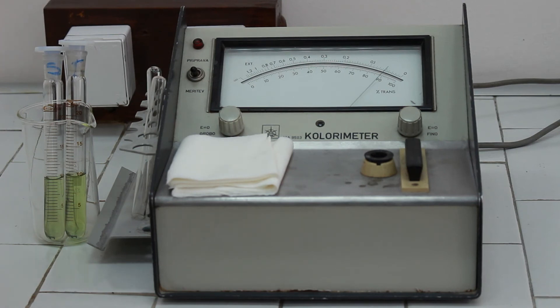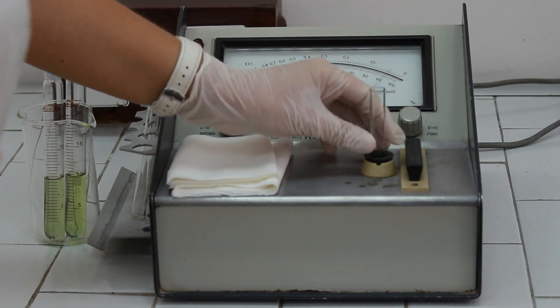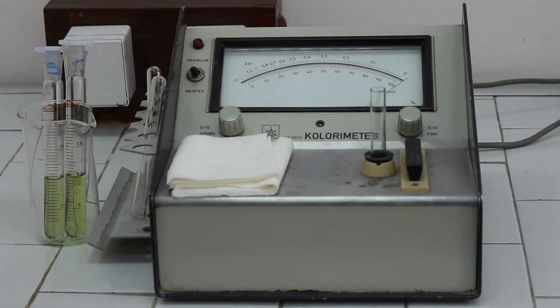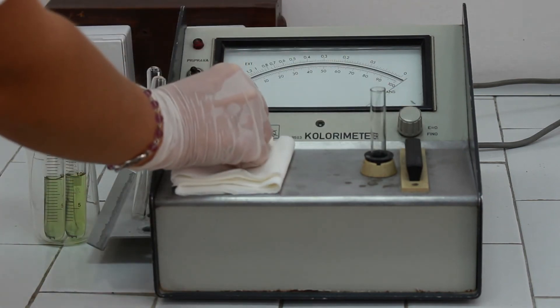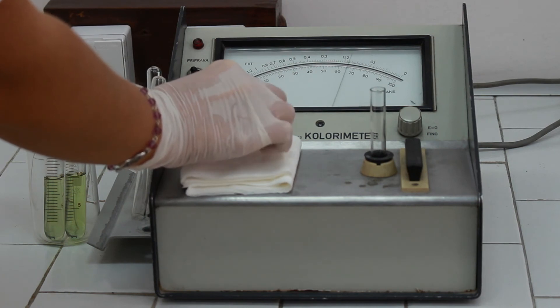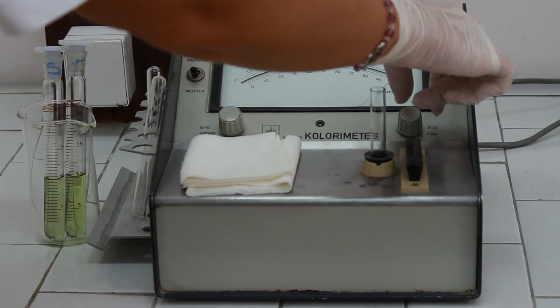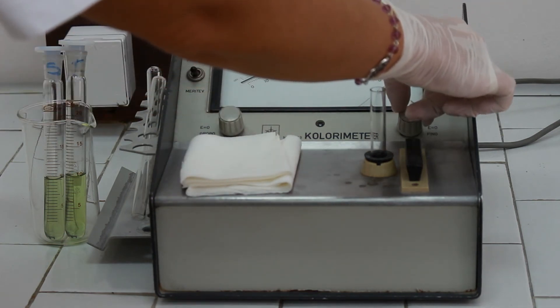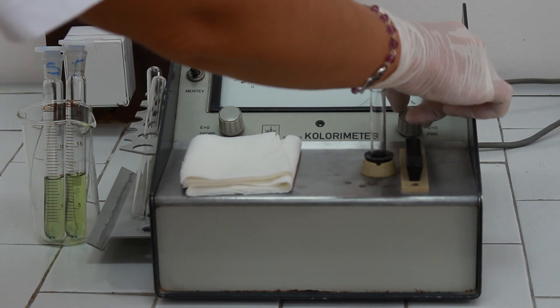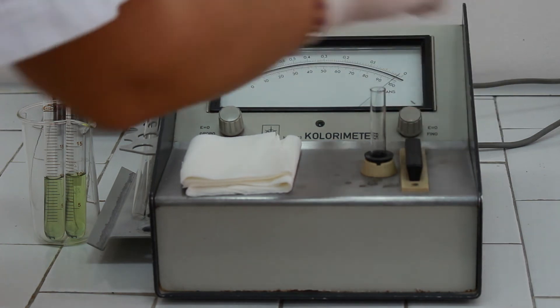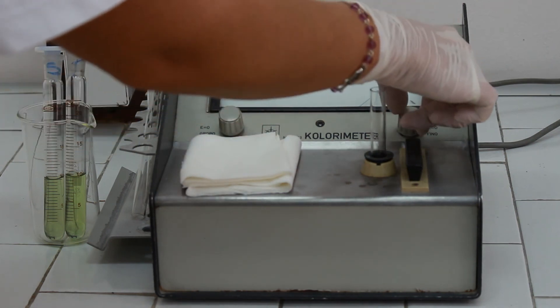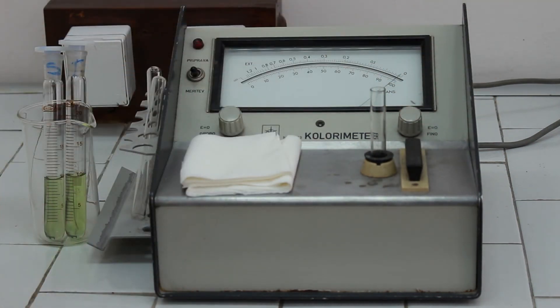Of course the procedure is the same as with any other photometer. First we need to apply the blank solution to the glass cuvette and to place the cuvette to the photometer. And then by using those two wheels to adjust the instrument to zero. Left wheel is used for rough adjustment of the zero of instrument.